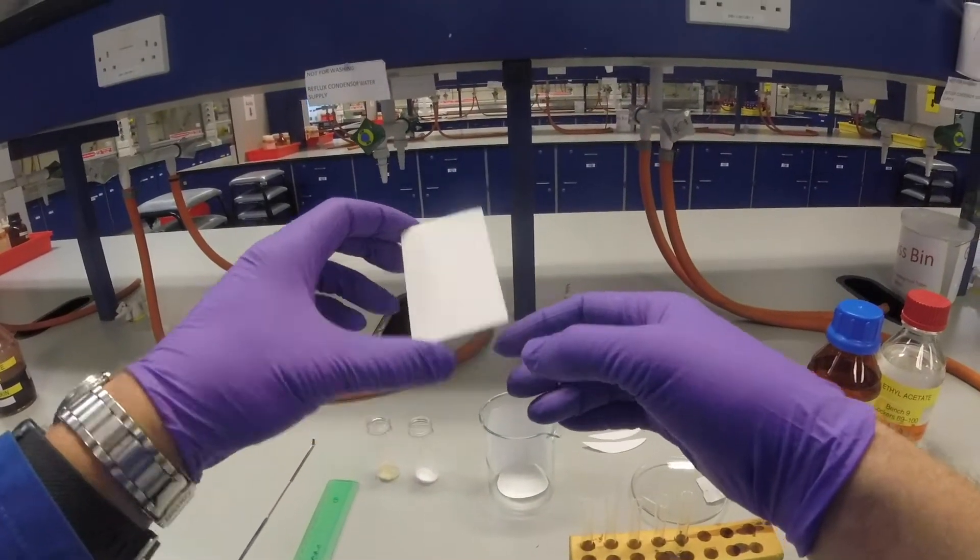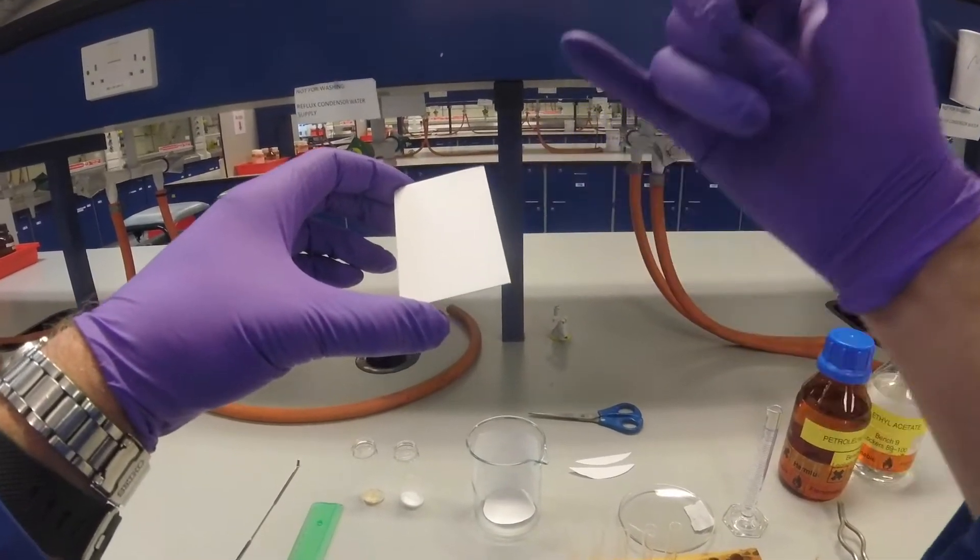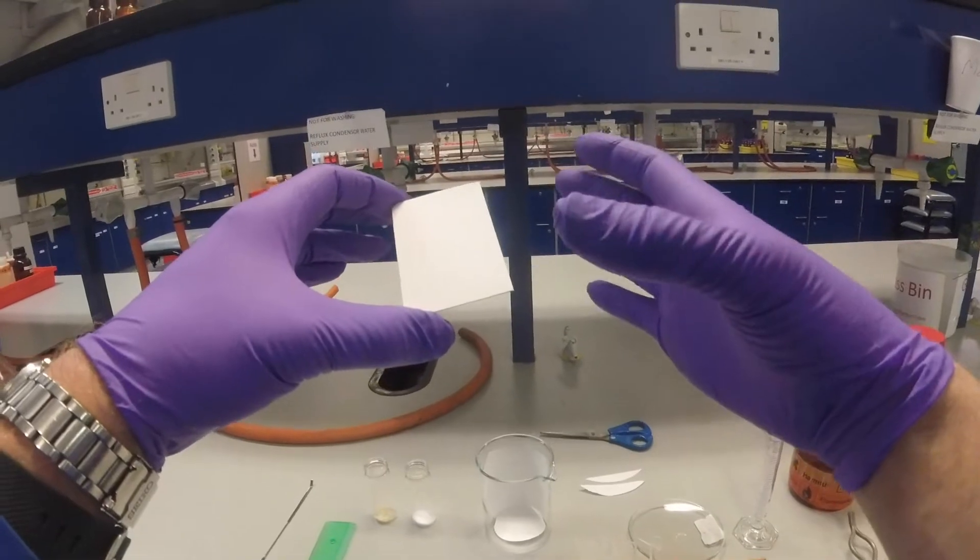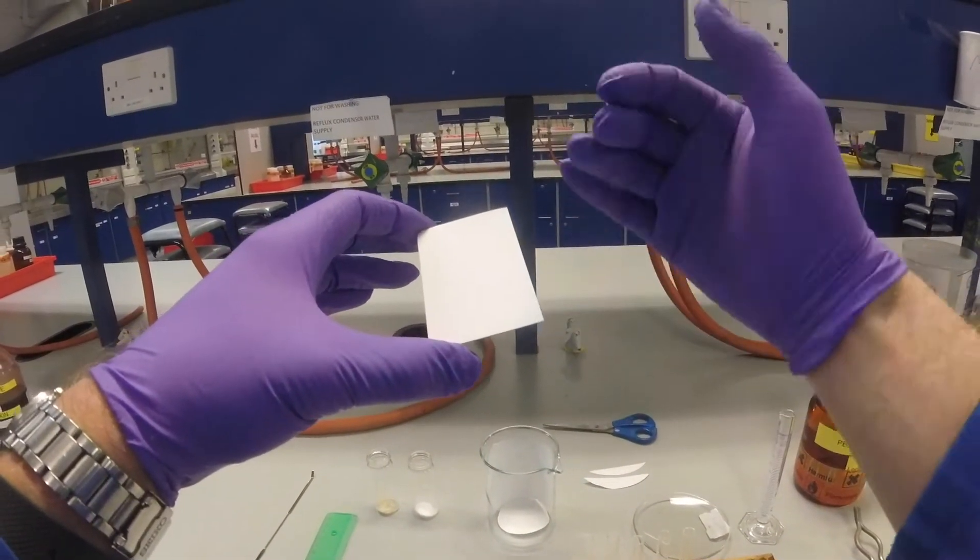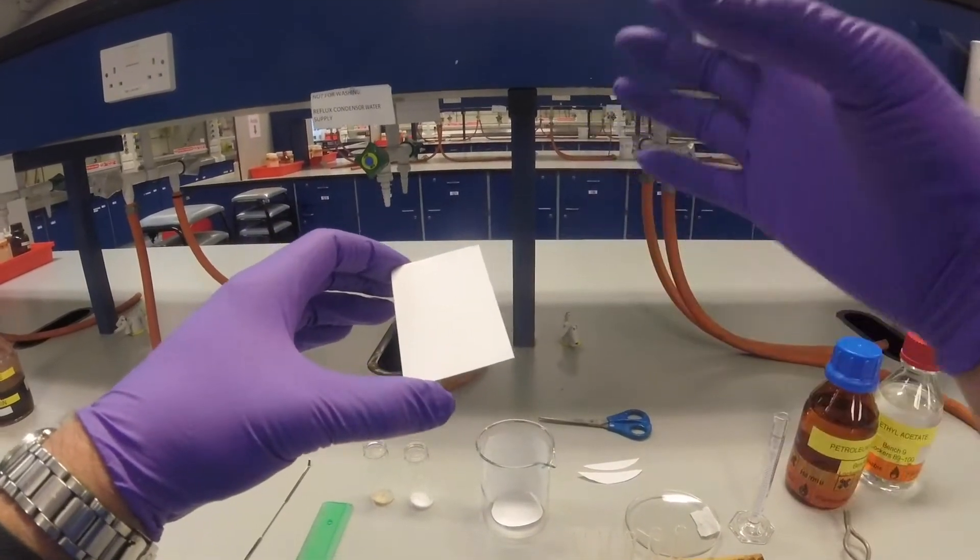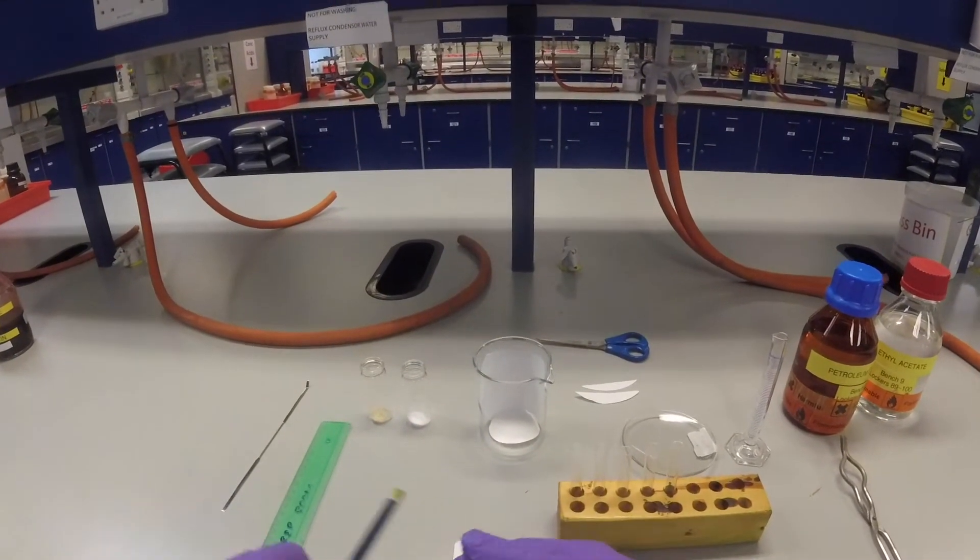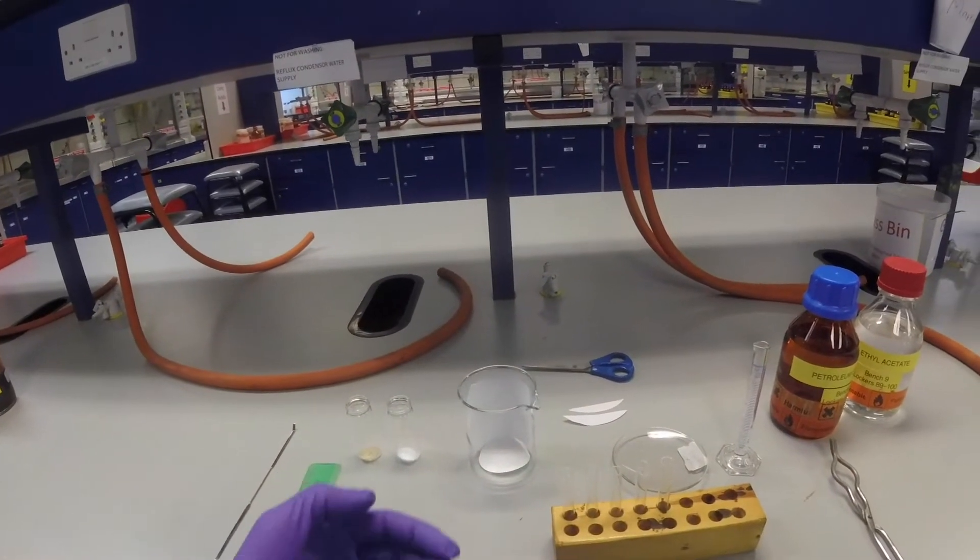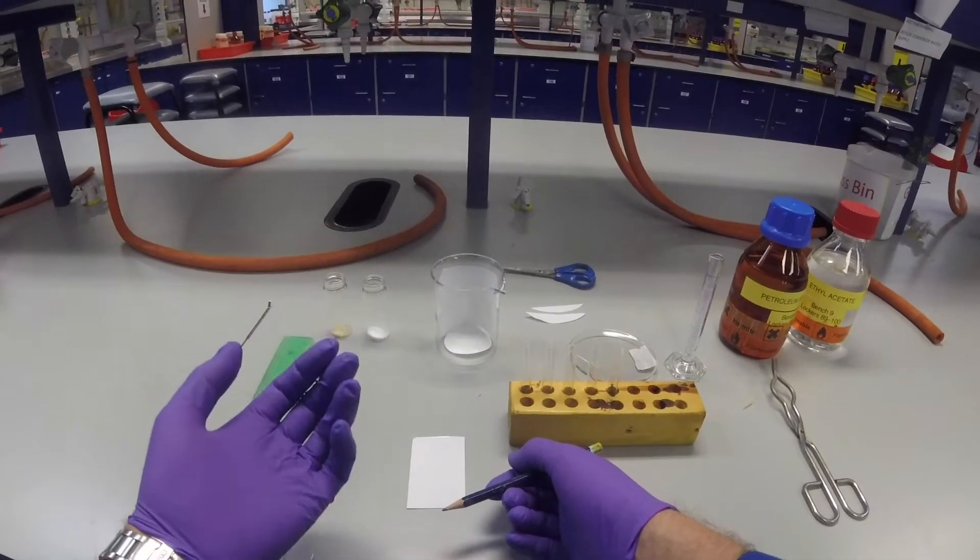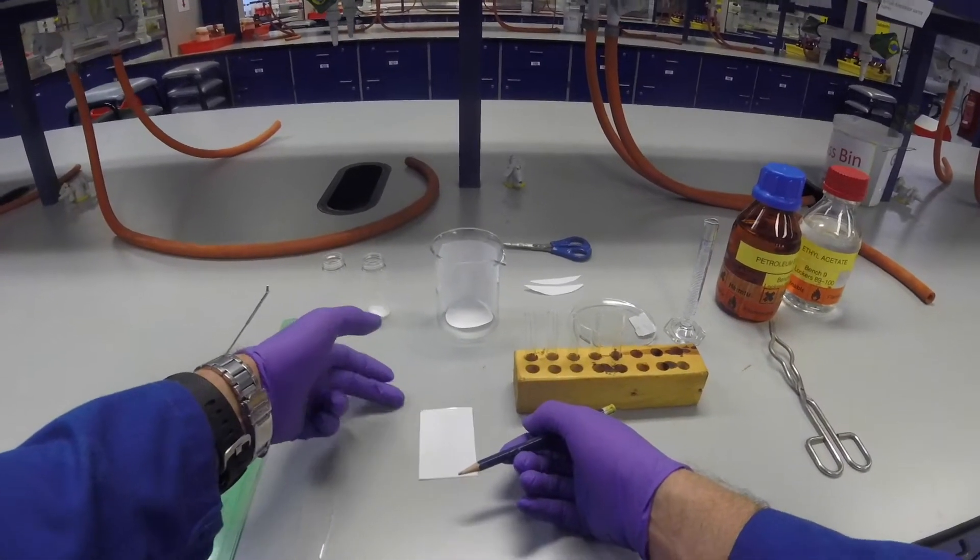The TLC plate is an aluminum plate with a thin layer of silica gel, silica dioxide, and the silica is your stationary phase. The silica has lots of SiOH bonds on the surface with a very large surface area, so there's lots of possibility for hydrogen bonding interactions to occur. More polar molecules will undergo more hydrogen bonding and stick to the silica and move slowly up the plate, whereas things with less polar groups will move more quickly up the plate as they interact more with the solvent than the silica.